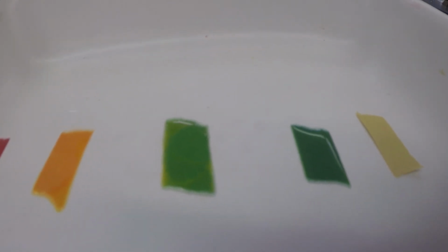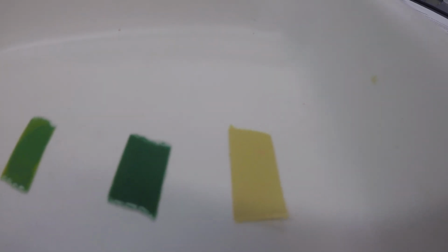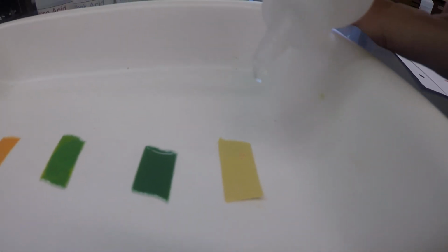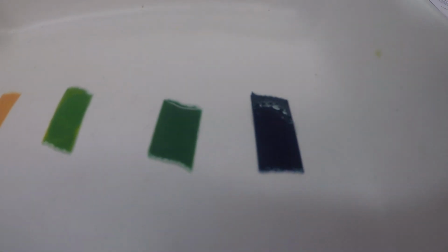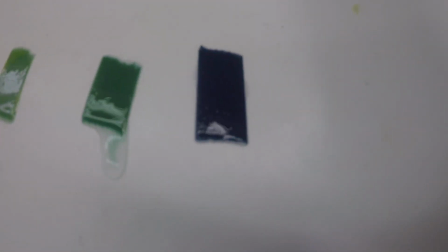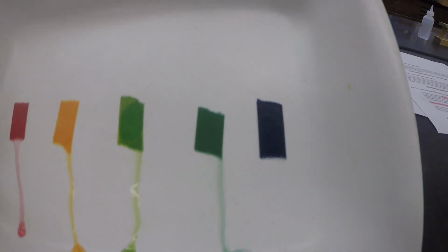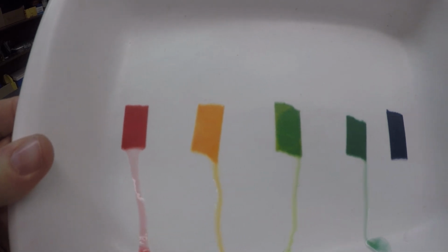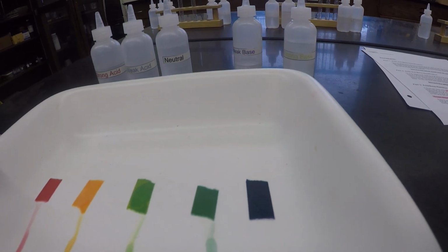You can see a difference between neutral and weak base. Then we're going to do our strong base. You can see those. So that is part 1.